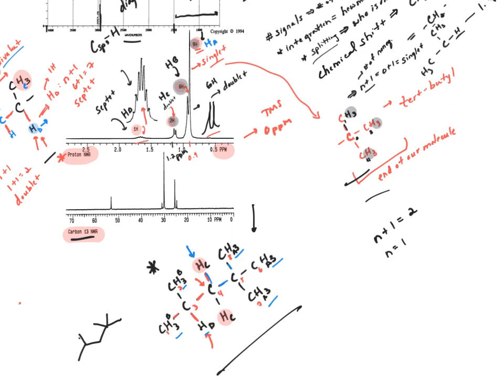As you move through these, you're going to find that they're a lot easier because you're going to get more practice in dealing with a couple of these very characteristic patterns. So it's going to be easy to see certain things long term. But redraw these if you want to. You don't have to print this, right? If you just want to redraw the IR spectrum.